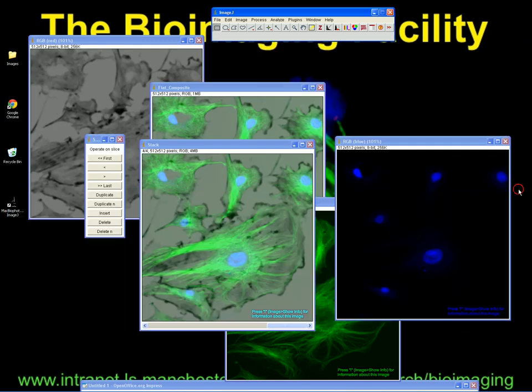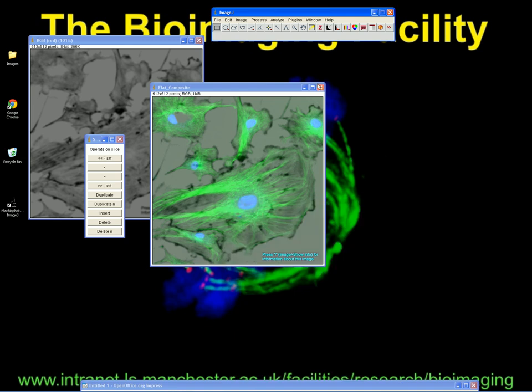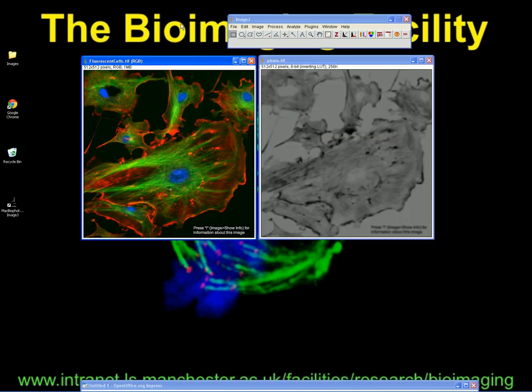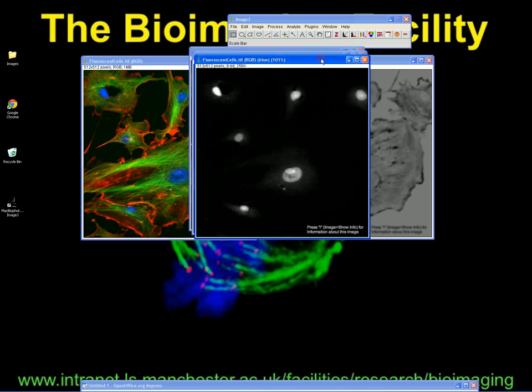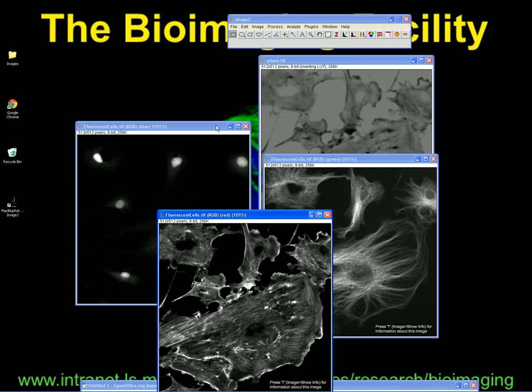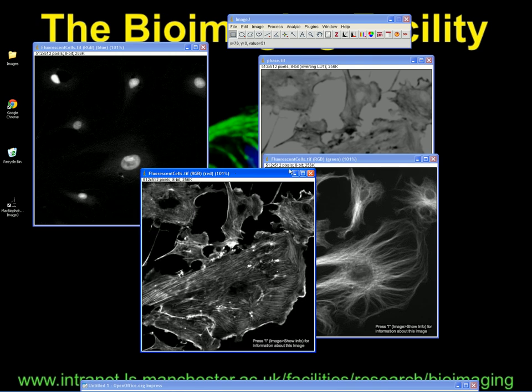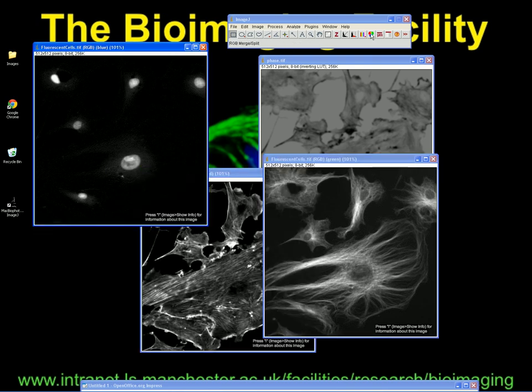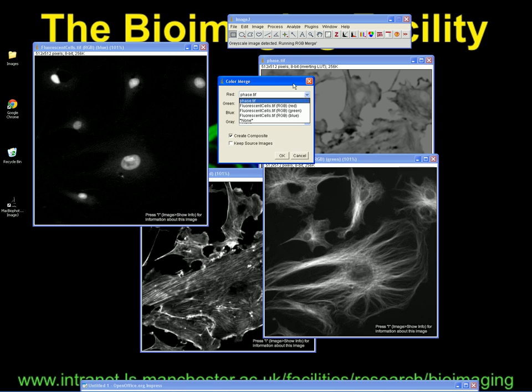It would be exactly the same if the stack was opened in a different order — exactly the same if you'd saved it as a three-colour fluorescence image and then the grey image as a separate TIFF. The first thing we need to do is split apart this RGB fluorescence image into its constituent parts, and then you're at exactly the same place as before where you can tweak all of the images and choose if you want to have the grayscale image included as well.